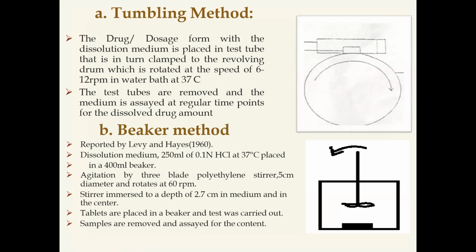In this tumbling method, the drug or dosage form with the dissolution medium is placed in the test tube.